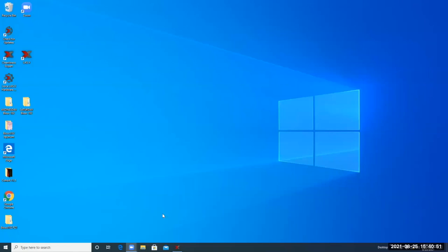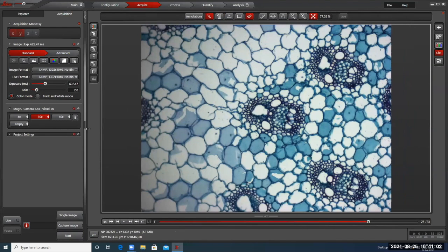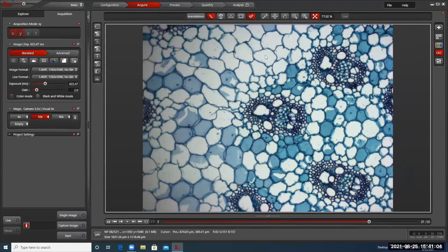So you go down to LASX here. Let me share the screen. Go down to LASX here, which I just started already. This thing here you don't need. I can't quite figure out how to make it go away. So you just drag this over here and make it go away physically. Okay, this is the old sample I was doing.